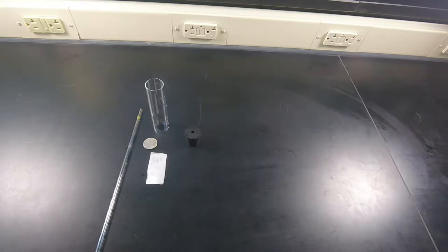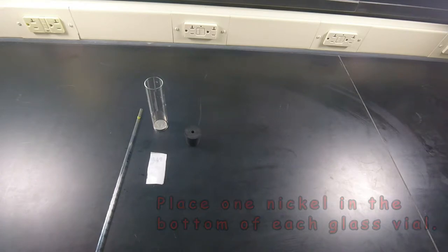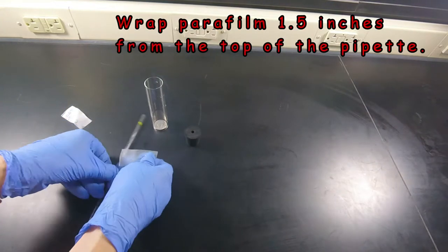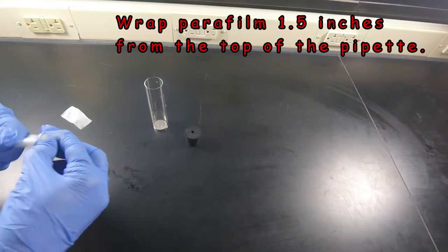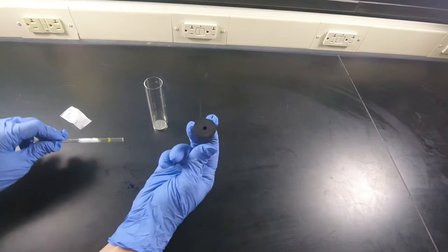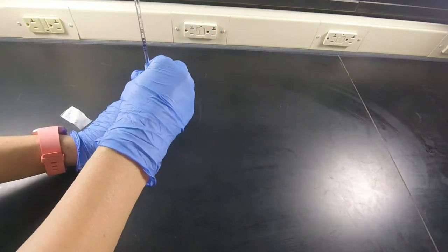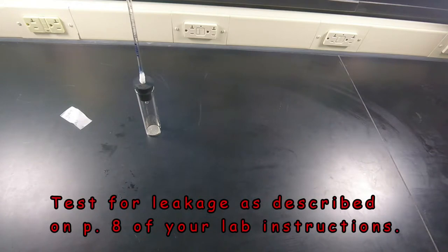The next step is the assembly of the respirometer. To do this, take one of your nickels and place it in the bottom of the flat-bottomed tube. Then take your piece of parafilm. You see, I've already cut it in half, so you have a 2-inch by 1-inch section of parafilm. Then you're going to wrap the parafilm around the pipette about 1.5 inches from the top of the pipette. Then you're going to take the larger end of the stopper and place it on the pipette, making a seal. Then place the stopper into your glass vial. And then you should test it for leakage as described in your lab on page 8.